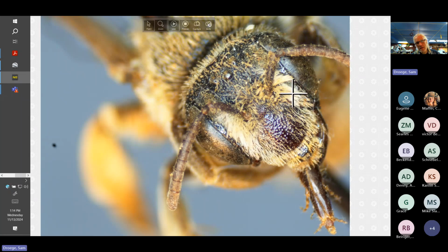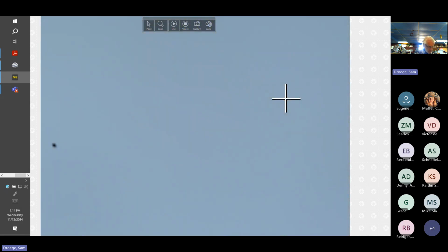And we can see it kind of peeking out here. I'm not going to spend a lot of time on this because we've seen these several times, but there's an implication in just that small window that it's relatively broad, not a slot, as it is in some other cases. So we'll remove that specimen.